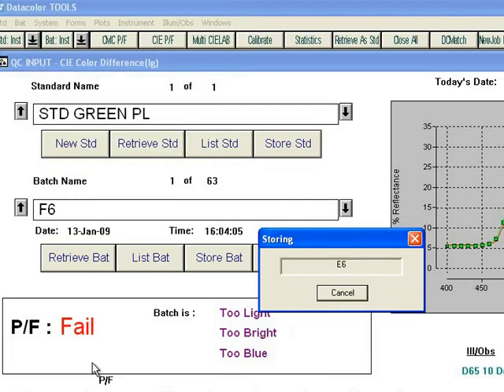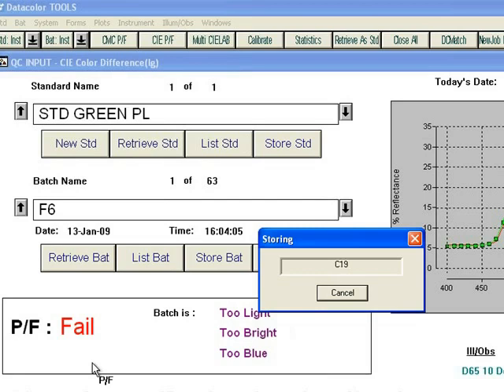It is important to mention here, you cannot store a batch without a standard. Batches and standards are also internally associated, so you can put batches in different folders, and they will always be retrievable to the correct standard.